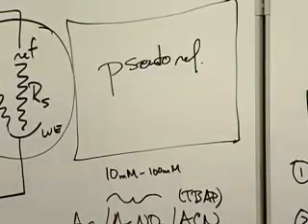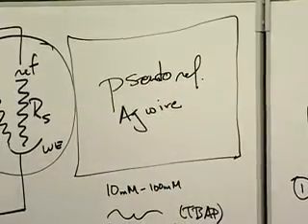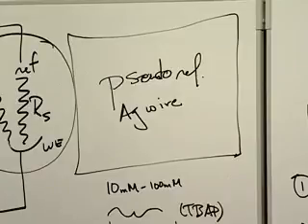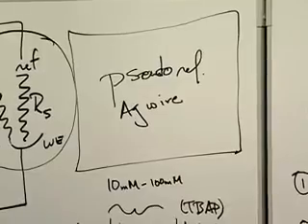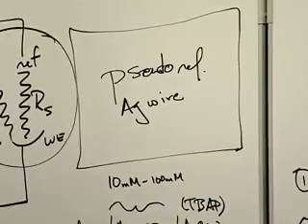And the easiest way to do a pseudo-reference is just a silver wire. So the idea is you're going to put that silver wire in place of your reference electrode, and there's going to be some current flow that will cause some ions to be generated, silver ions. And they will stay near the silver wire for some short period of time, but of course you're making more ions as time goes on, and so you have more or less a constant concentration of silver ions near your electrode, as long as you don't need it to stay constant for a long period of time.